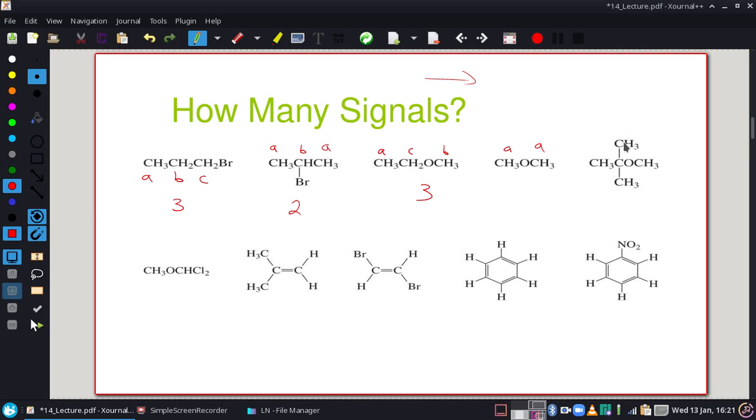And same thing kind of happened with all 9 of these. Those are all equivalent to one another because they're just CH3s right off of a C that's connected to a bunch of CH3s. They're all chemically equivalent. But this other one, because it's separated with this O, is going to be different, giving us 2 peaks. I said 2 there, that should be a 1.